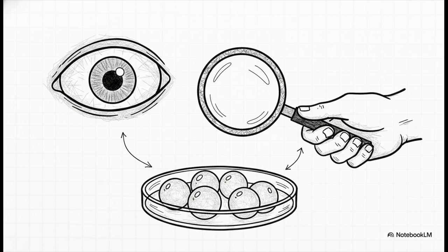Every single one of those unfertilized fish eggs is technically one single biological cell. They are so massive that you can see their basic shape, color, and boundaries with completely unaided vision. Or, maybe a basic magnifying glass if you want to catch just a little more detail.